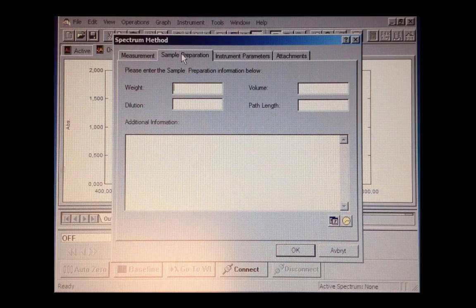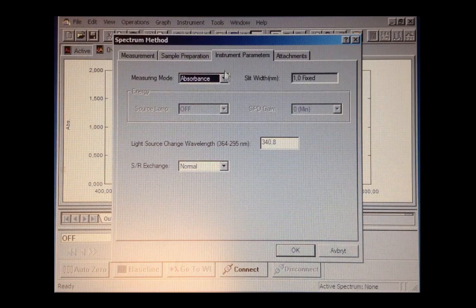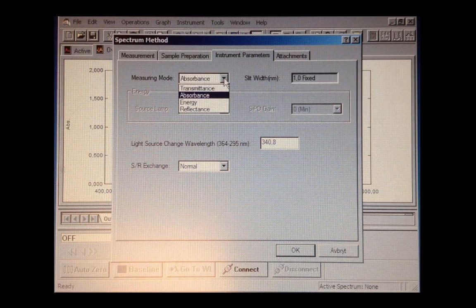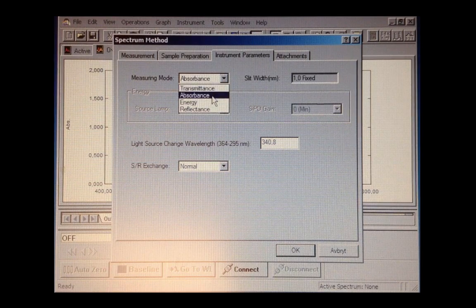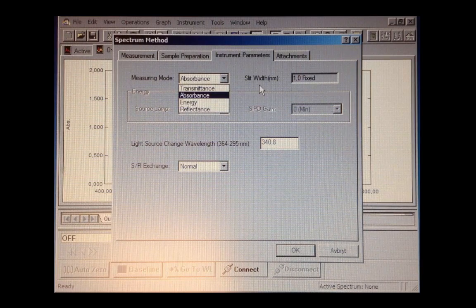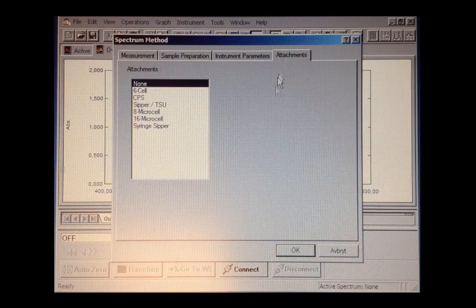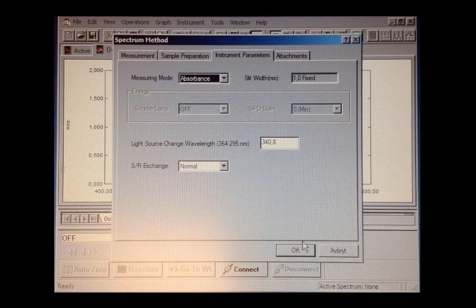For sample preparation, you need to give some information about your sample. And in these instrument parameters, select which mode you want to use: transmittance, absorbance, or reflectance. You don't need to do so much in this section. You just click OK.